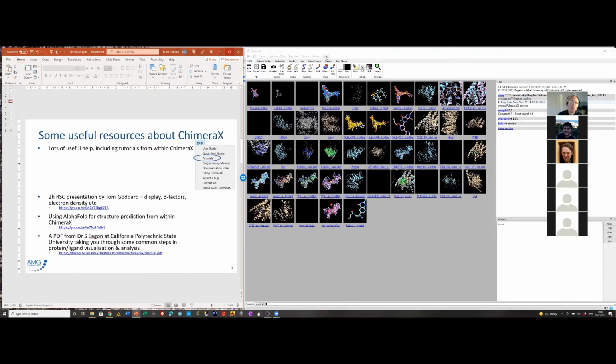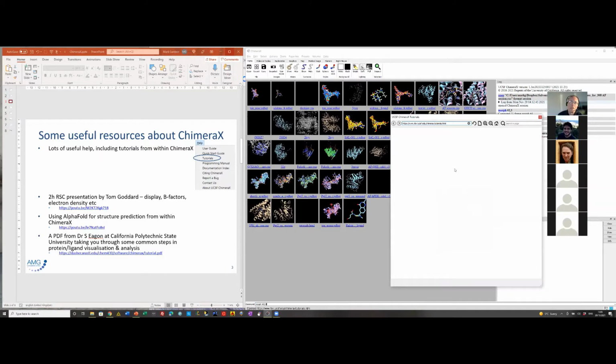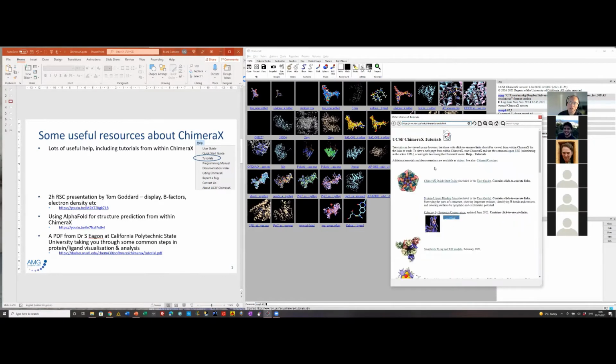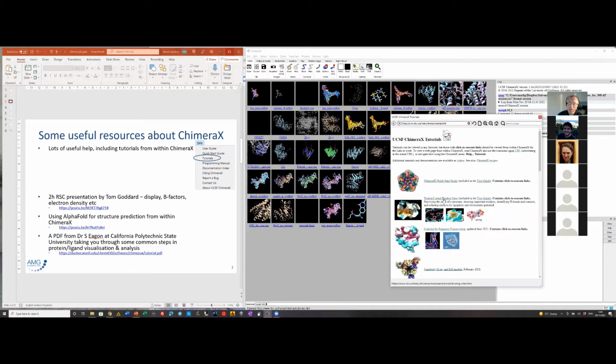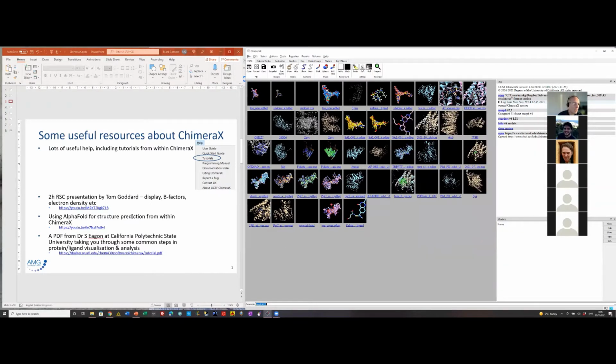If you open one up from within ChimeraX itself, you can click on the links and they are active, so you can essentially do the things live in your session that they demonstrate. I'm going to go through some of those things.